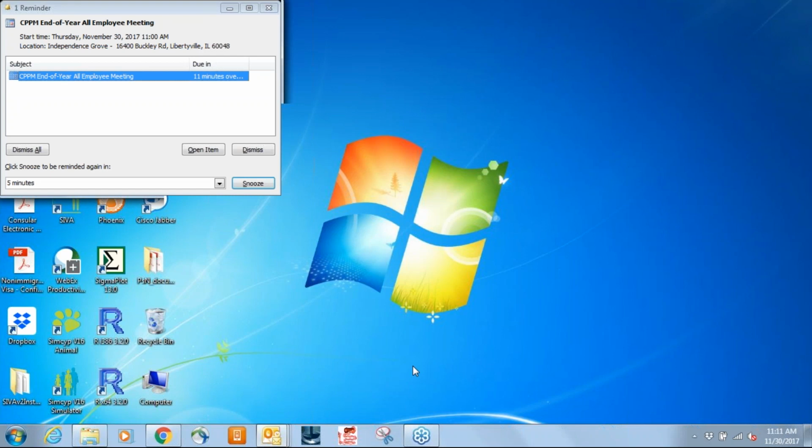Just a thought again on this USP4. If DDDPlus has a facility to look at USP4, can we train the software using USP2 data and then predict what the dissolution profile would look like in the USP4?